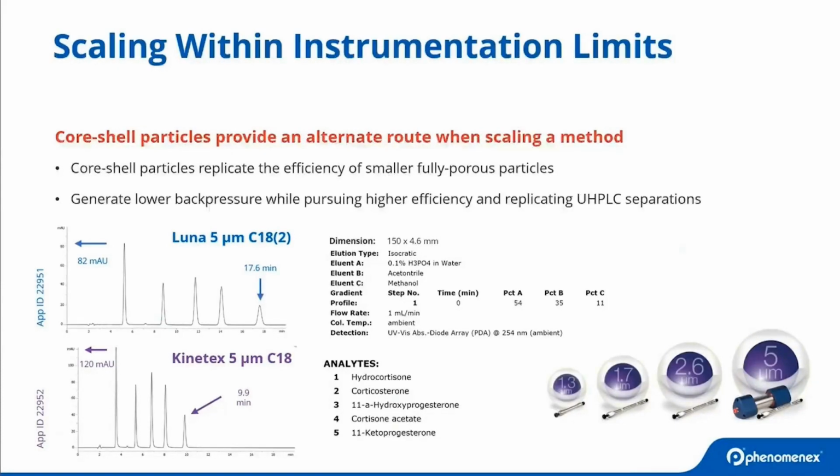So now we have a chance to revisit 2 chromatograms that we saw earlier. When using core shell particles, you don't necessarily have to use smaller particle sizes. You can use the same particle sizes with which you're accustomed and achieve sharper peaks within shorter runtimes.